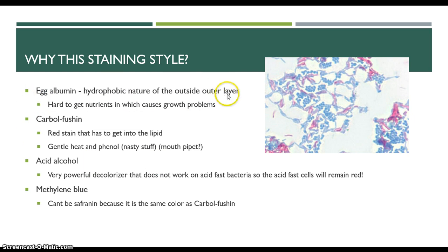But the first step is egg albumin, to suspend the bacteria, and then the carbol fuchsin is the main stain. That's a reddish pink stain. It looks a lot like safranin, a little slightly darker, but it looks a lot like safranin.